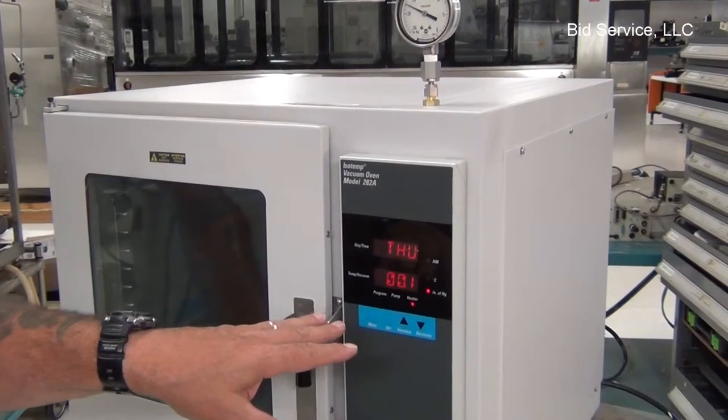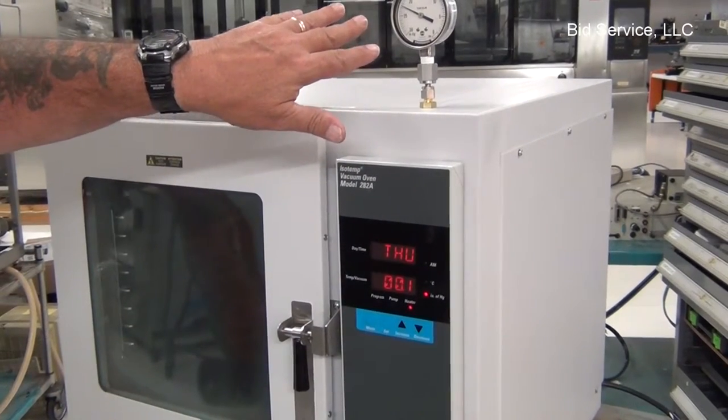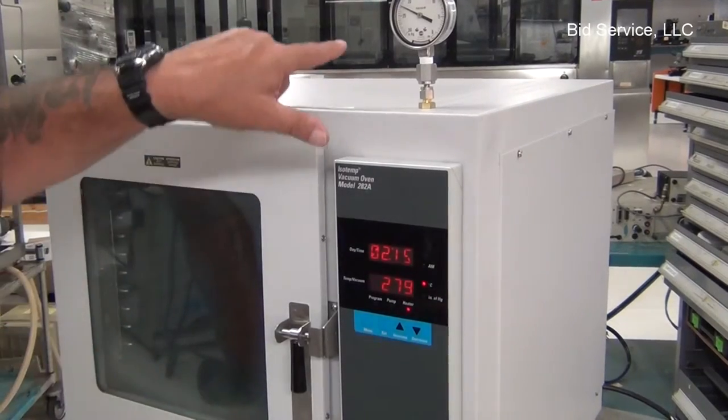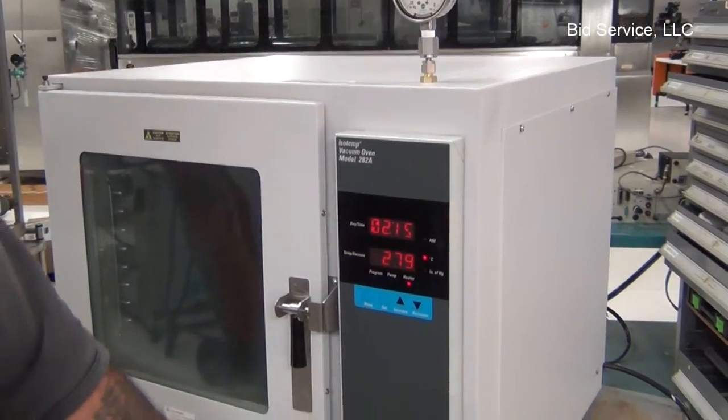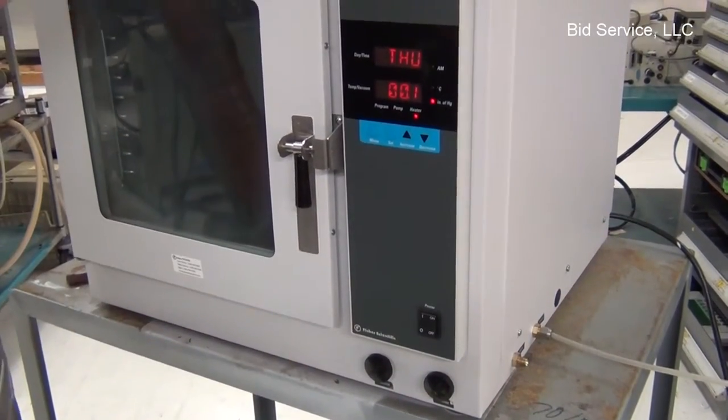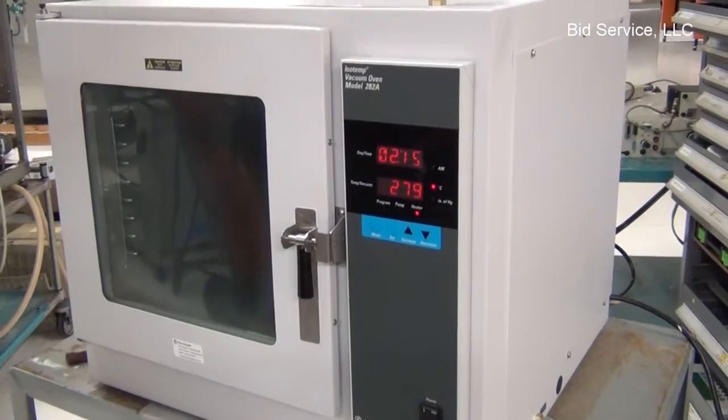The digital display has been disabled in lieu of the vacuum gauge that we have sitting on top here. I have the vacuum pumped down. The vacuum is now shut off, so you can see that it's still holding vacuum.